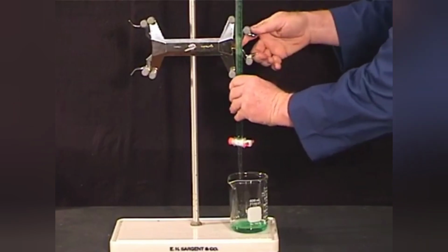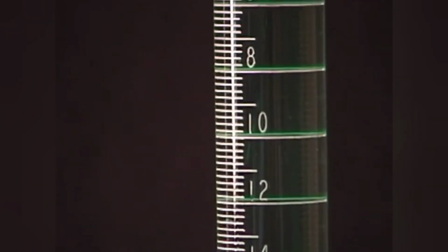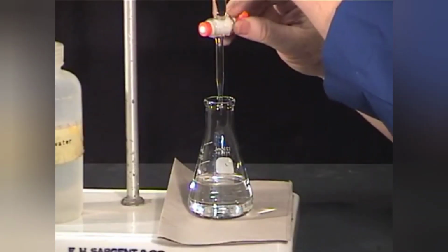As the camera pans upward, observe how the back half of each line gradually becomes hidden by its front half as the camera's view becomes horizontal. To avoid parallax error, your view line also must be absolutely horizontal. Adjust the initial reagent level to anywhere between 0 to 2 milliliters. Hold your finger or a white piece of paper behind the burette to facilitate the reading and read from the bottom curve of the meniscus, estimating the hundredths place. Now you are ready to begin the titration.